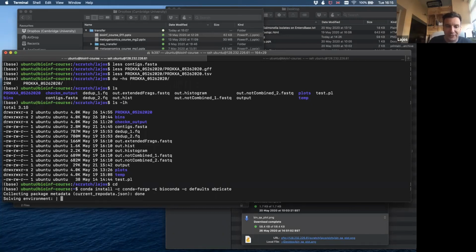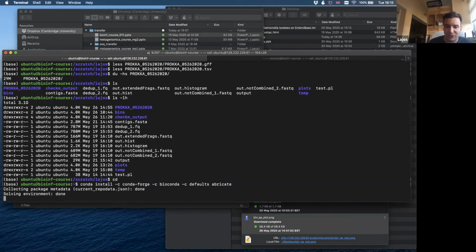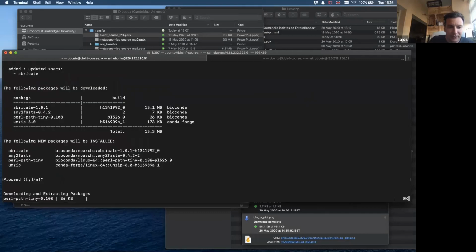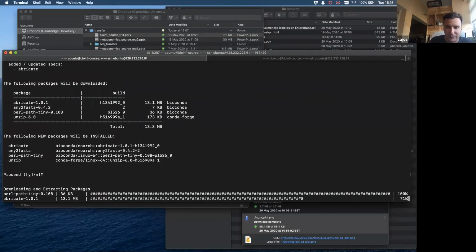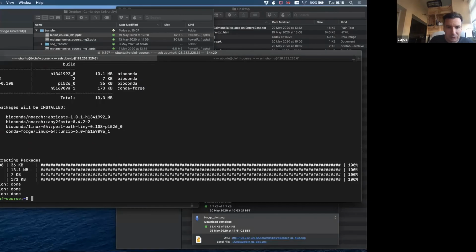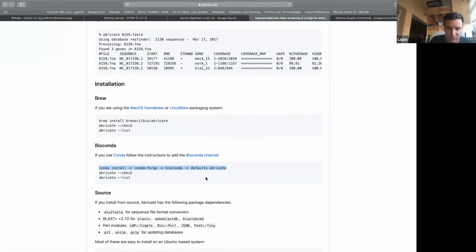Or anything else? Why are we waiting for the installation? There is nothing much to say about how this program is running. It is looking for gene sequences. So yeah, it's only this very short installation. I think, is this everything? It has also installed all the databases.